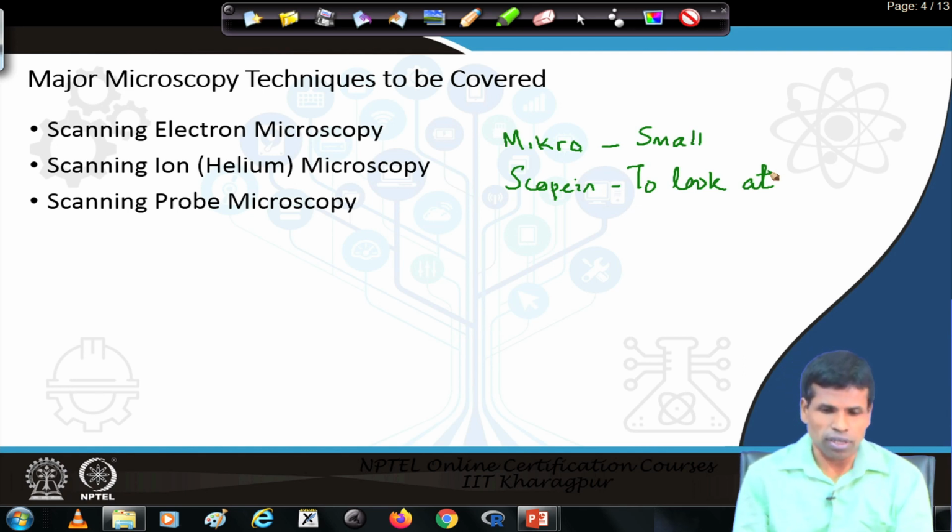This is the middle word coming, that is, probe. If we use a physical probe, like a blind man does, he uses his white cane to locate an object or something close to him or her. Similarly, we can use a physical probe to measure the size and shape of an object. So here you see the middle word, electron, ion, probe, coming into the picture of microscopy.